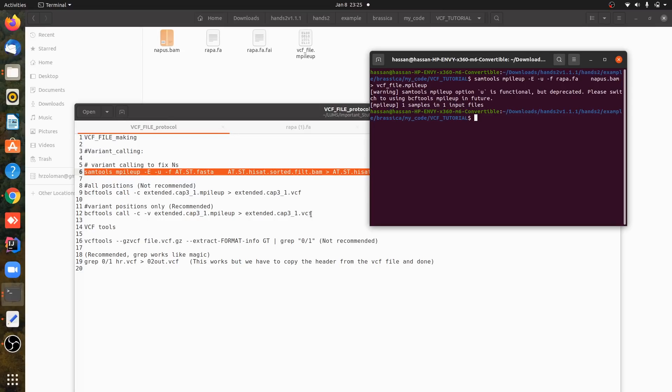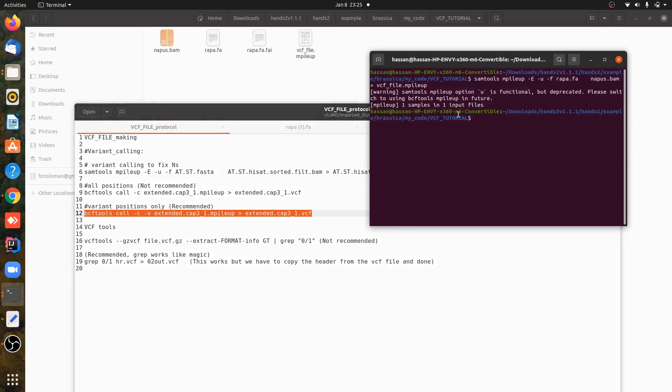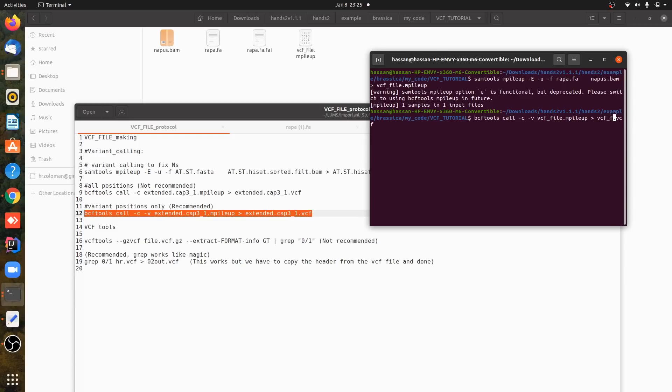Let me just copy the commands. So we have copied the command. We are calling the VCF file.mpileup. You have to edit this mpileup here and write your own VCF.mpileup file, and it will give us a VCF file now. So VCF file.vcf is the extension.